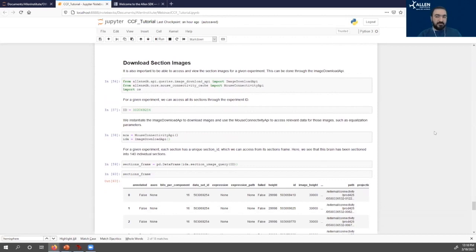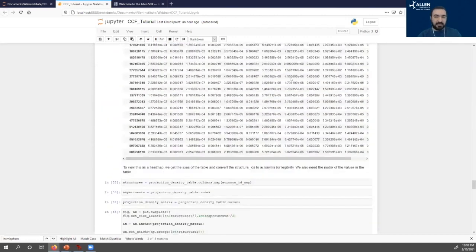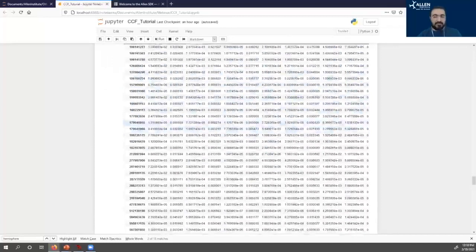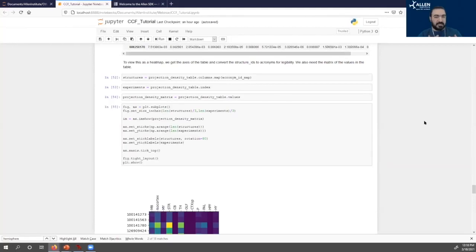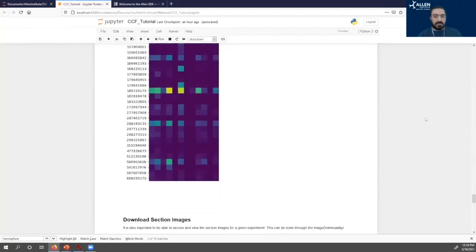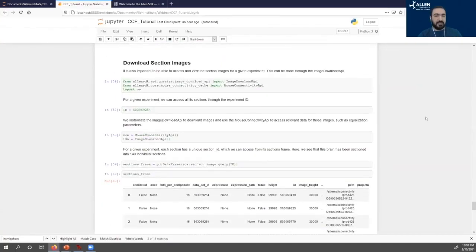Finally, when you look at these numbers and these values, it's hard just looking at the numbers to really have a sense of what that means. Again, ITK-Snap helps visualize that, but there you're looking at data that was registered. It also helps to be able to go back and look at the raw images themselves. Of course, you can do that again through the BrainMap data portal.